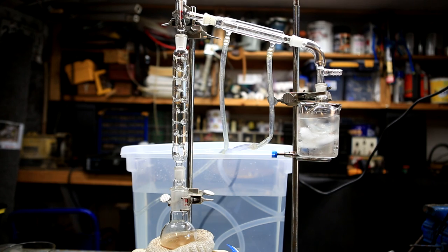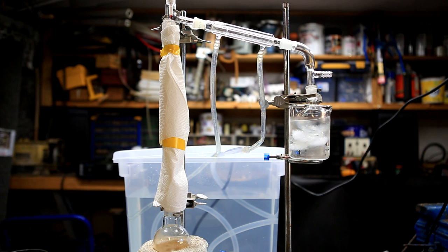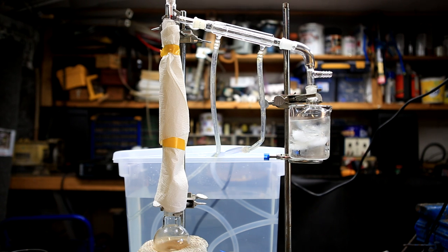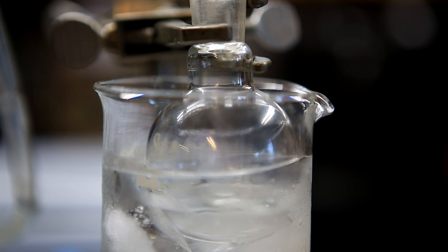It is stirred over the sieves for several minutes and then a fractional distillation is carried out. To make the distillation faster, I wrapped the column with some paper towel to insulate it. I collected the fraction that boiled between 48 and 53 degrees Celsius.